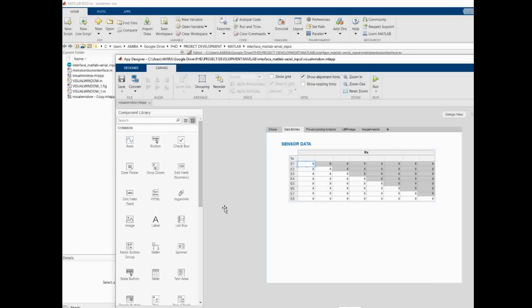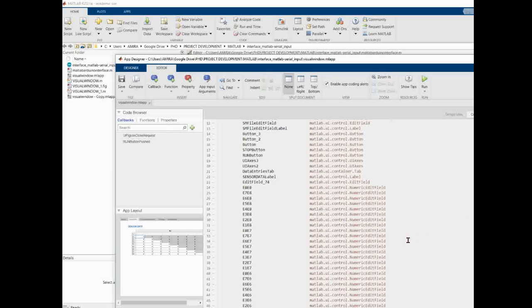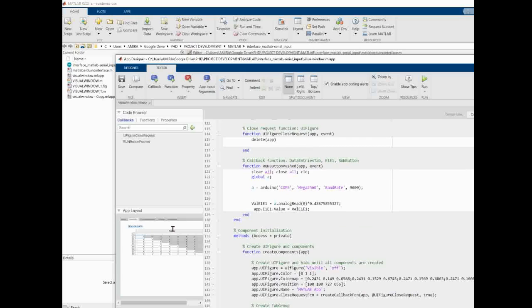when measuring the analog measurements from the Arduino, it will display here. This is what I'm currently working on. I'm trying to assign this tab here, these small cells here, for single analog input measurements. This is what I've been trying to do.